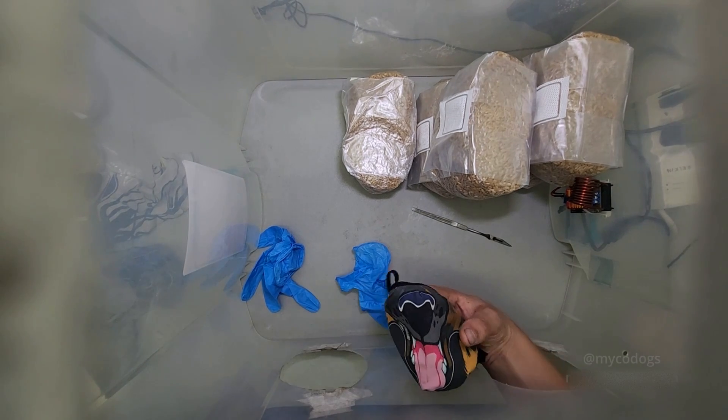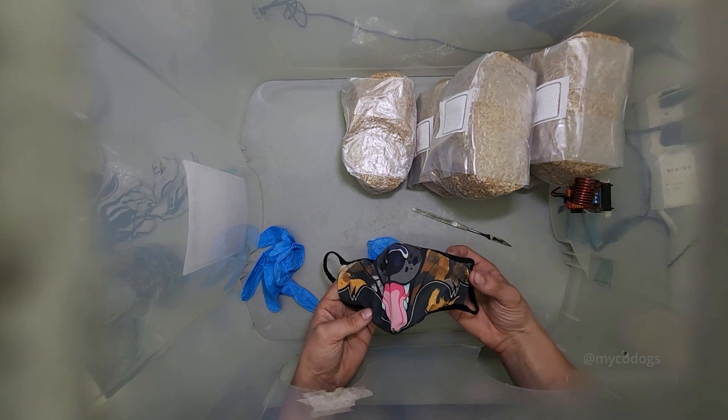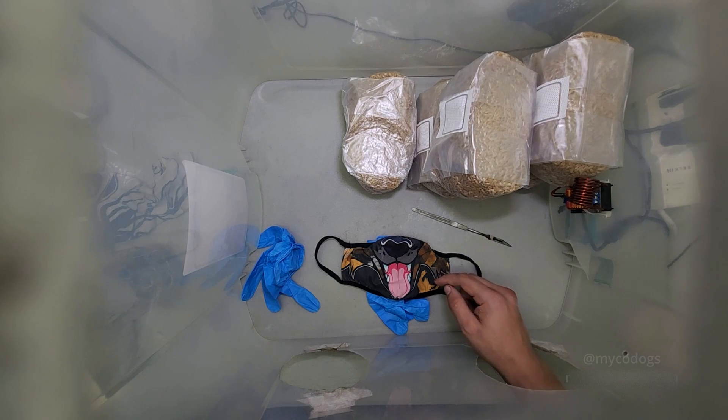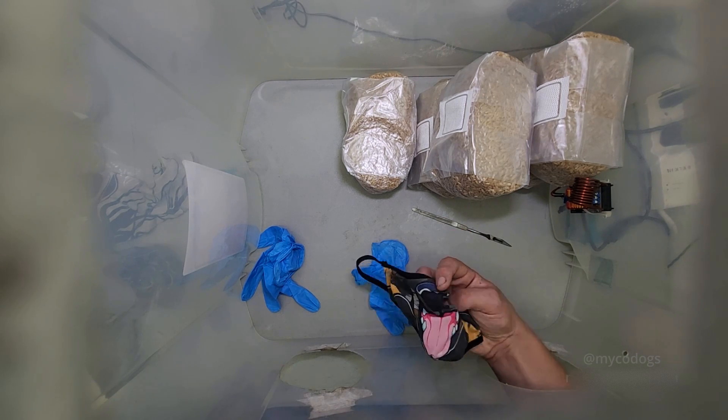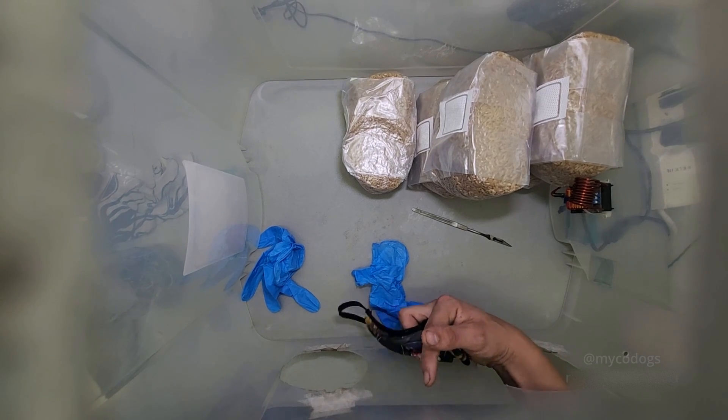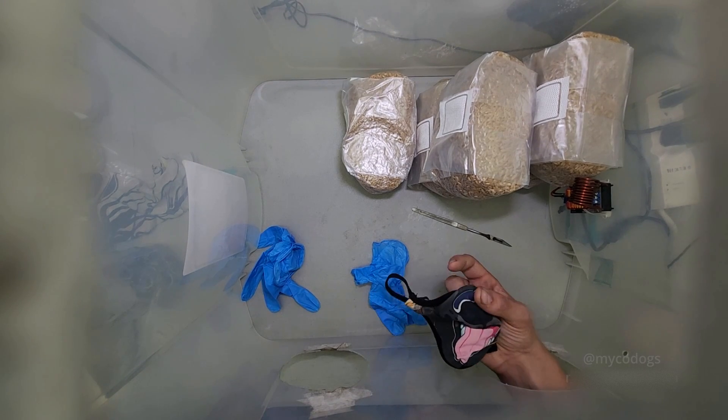Another good item to have while working in a still air box is a mask. This will help prevent you creating unnecessary air currents and it will also stop you from spitting bacteria all over your workspace. Although it's not completely necessary because there is a plastic barrier in front of your face.